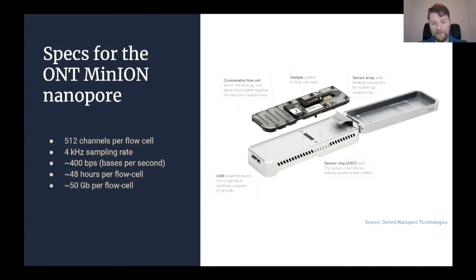because the flow cell expires over time, the pores stop working, they're biological after all, things get stuck, they get destroyed. So typically you will be able to run this thing for about, once you start it and put it on, it will sort of slowly, the DNA will diffuse from one chamber to the other, right? But after 48 hours, it usually doesn't work so well anymore. Then it usually stops. And that gives you, with all the loss and everything, about sort of the ability for a single flow cell to produce about 50 gigabases before it runs out.